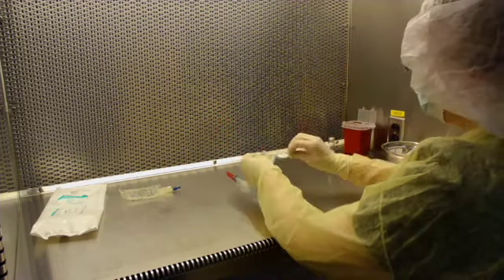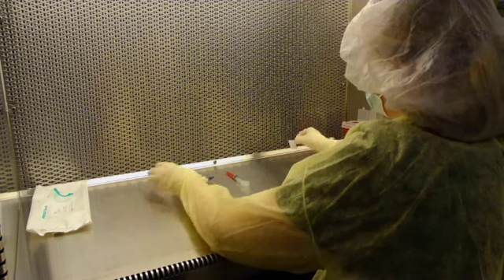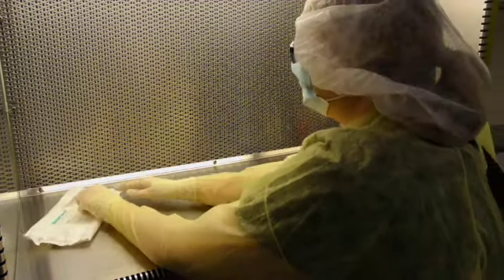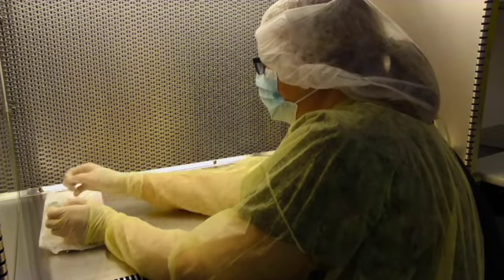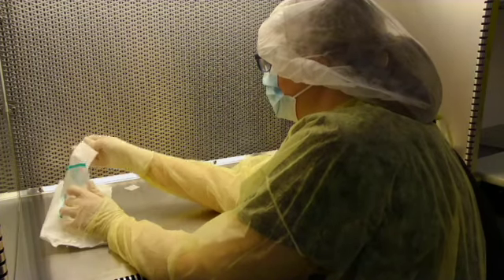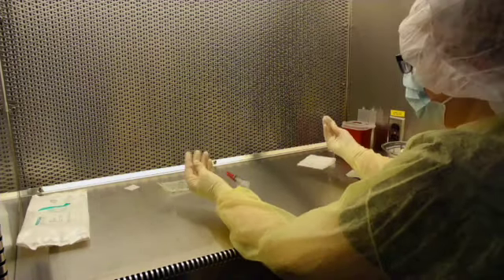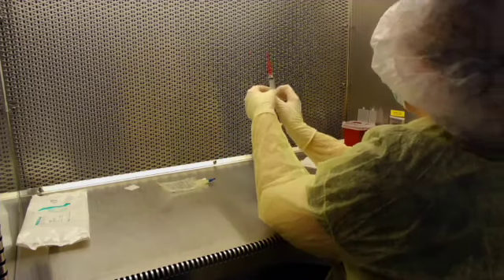At this point, you're going to want to cleanse your hands as you've touched the dust wrappers, and you want to wash them before touching your sterile products. I like my alcohol swab for my needle cap on my left-hand side. I also like to have a little piece of alcohol wipe so I can clean my fingers after I think I might have contaminated them in any small way.